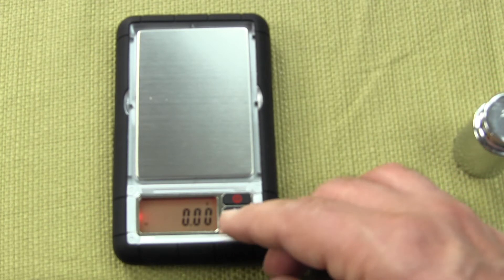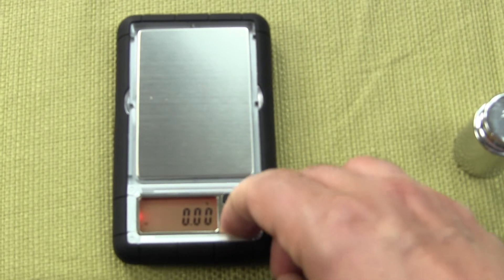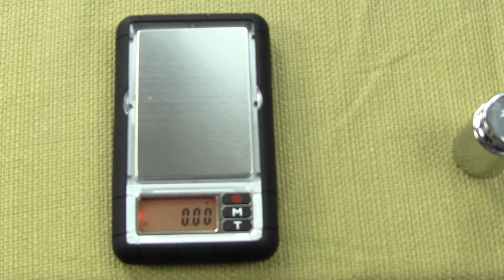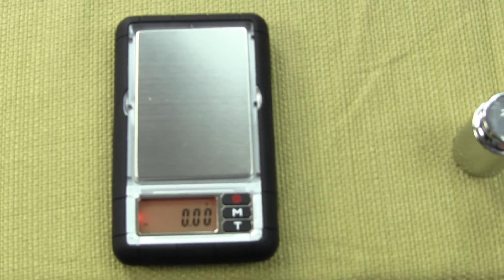To perform calibration, one simply zeroes out the scale by pressing the tare button, so nothing is on the platform and the scale reads 0.00.